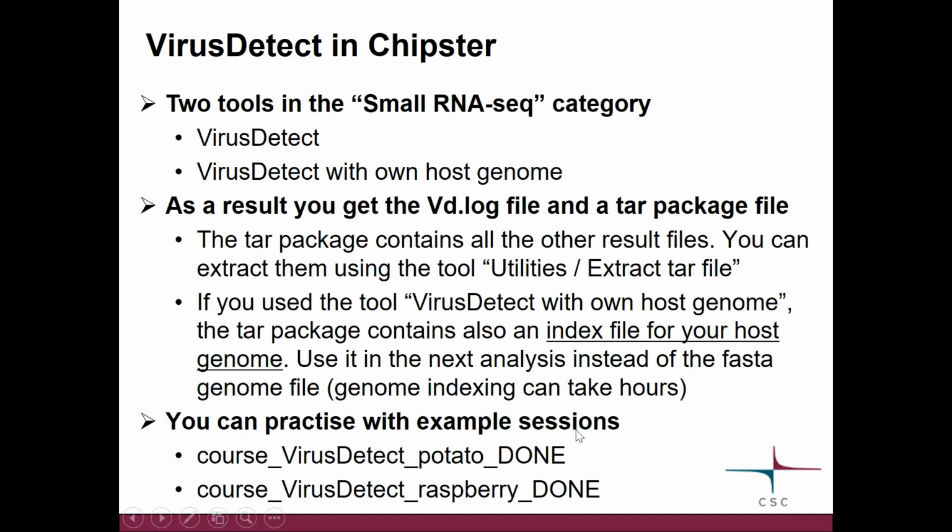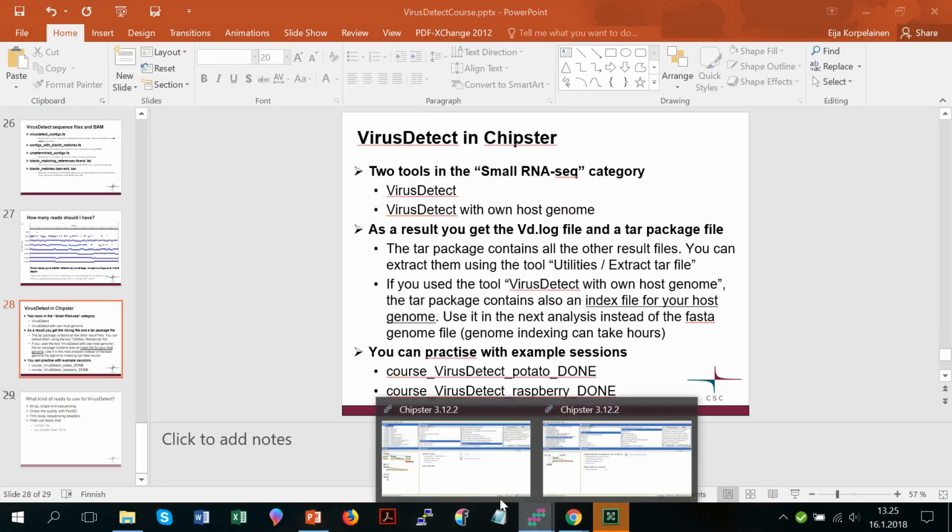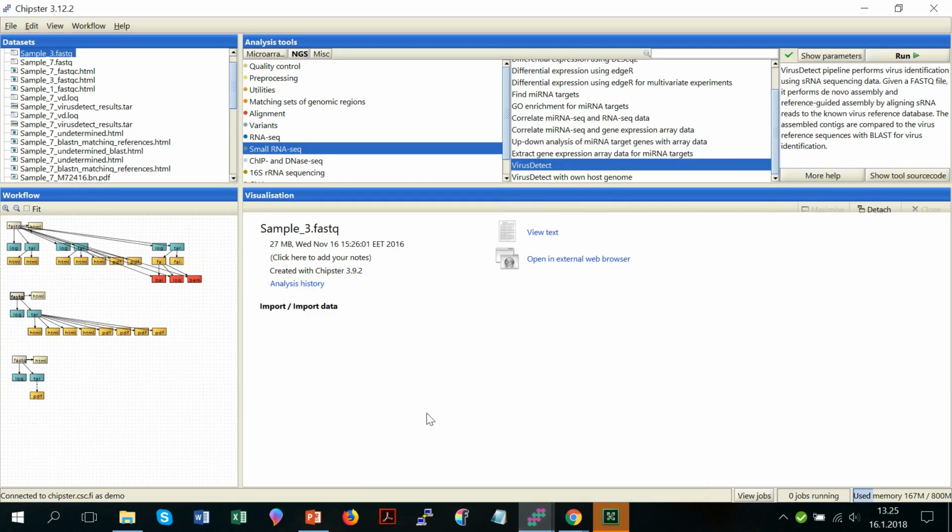Then finally, what I wanted to say here is that if you are interested in VirusDetect but you don't have your own data yet, you can still get familiar with the system in Chipster, because we have made some ready-made analyses for you that you are welcome to inspect. And this is something that I'm going to show you now. So I'm taking you to Chipster now.